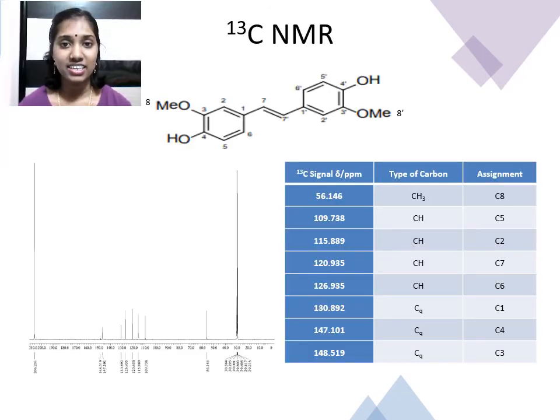This slide is the interpretation of the carbon NMR spectrum. In this spectrum, the observation of 30 ppm and 206 ppm with the given multiplicity indicates the solvent peak of acetone. Apart from this, the counted lines in carbon-13 NMR indicate that there are 8 types of carbon environment. As we know, this is because each unique carbon gives a different line.